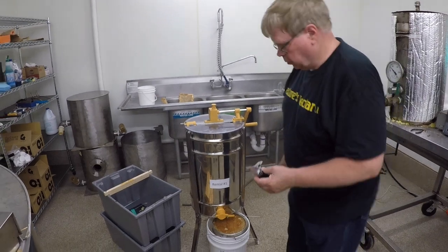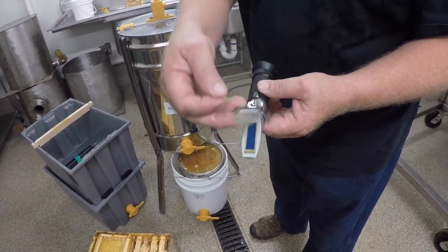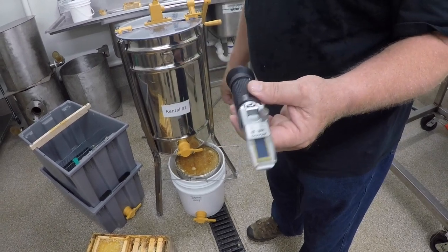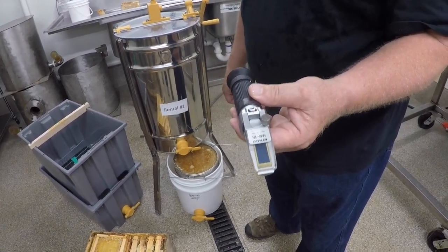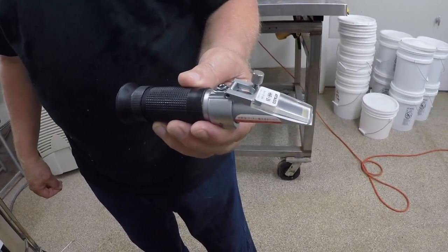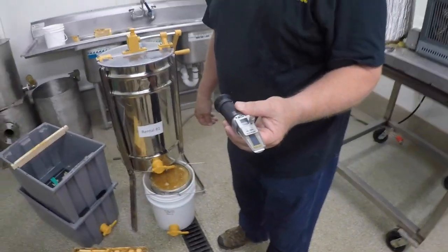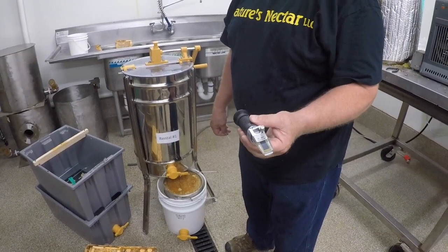This is a refractometer. We're going to measure the water content of our honey. This is a refractometer made for honey. There are many refractometers out there, and you have to buy one that's made for honey. Any other refractometer will not work because it's not set up for that scale.